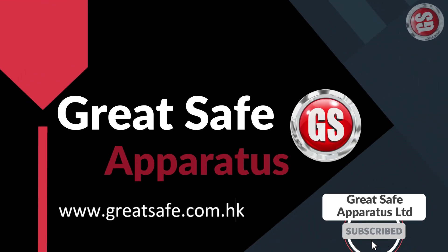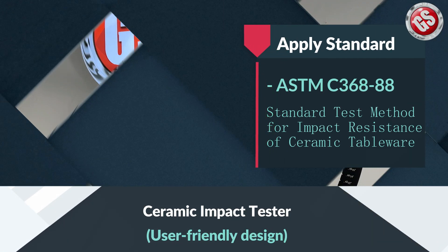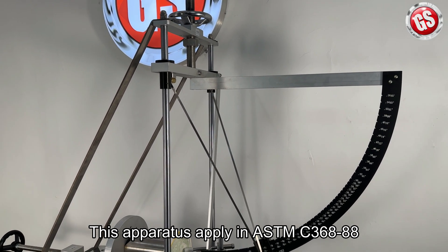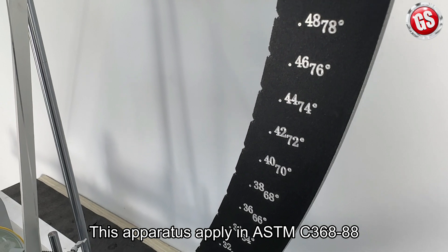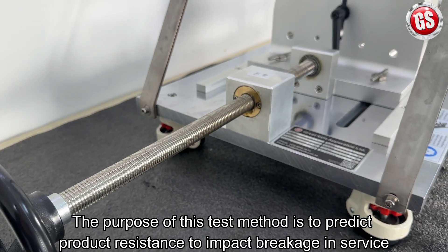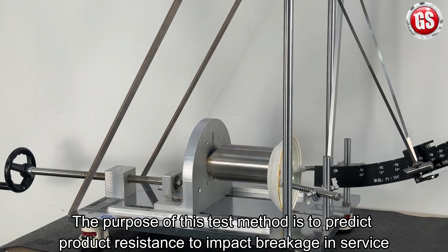Welcome to Great Safe channel. In this channel we will show you the testing machine operation. This is the ceramic impact tester, which applies ASTM C368-88. The purpose of this test method is to predict product resistance to impact breakage in service.